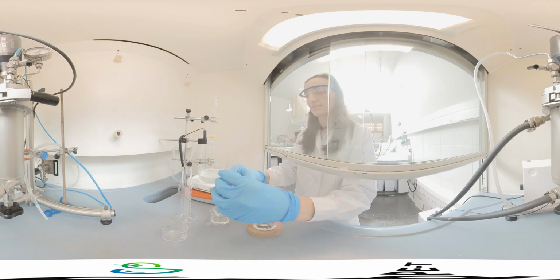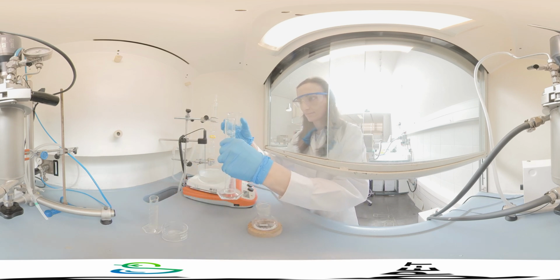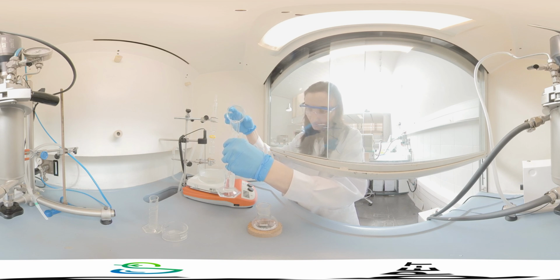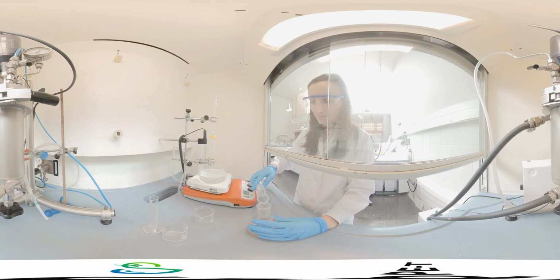2-chloroethanol is obtained by selective chlorination of one of the alcohol groups of ethylene glycol. To obtain the best reaction yields, several parameters such as reagent concentrations, reaction times, and temperatures have been evaluated.